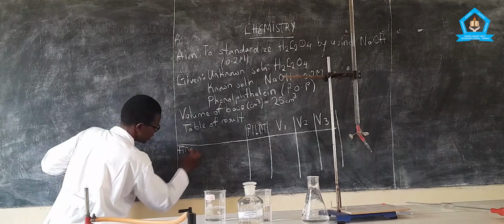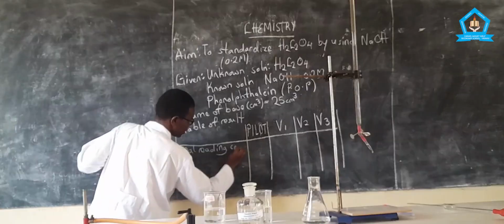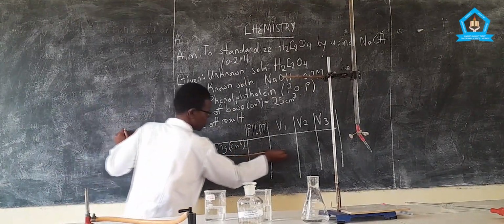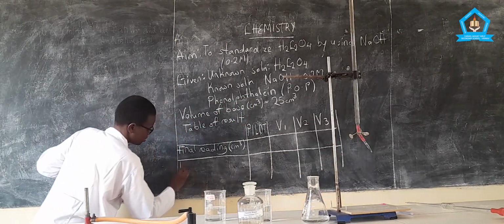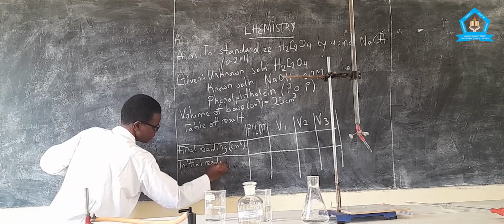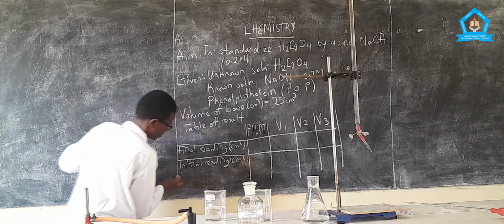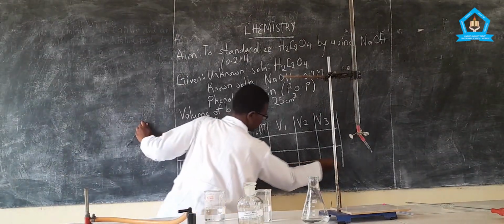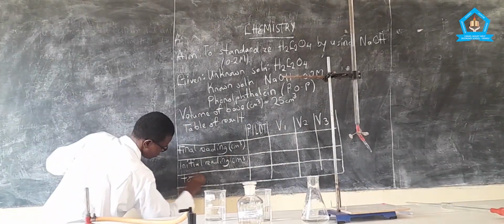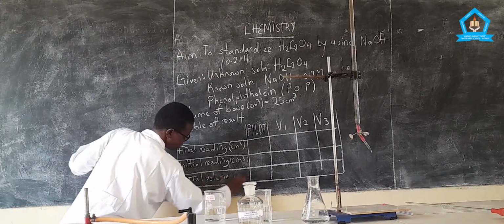Here we write our final reading in centimeter cubic, initial reading in centimeter cubics, and our total volume in centimeter cubics.